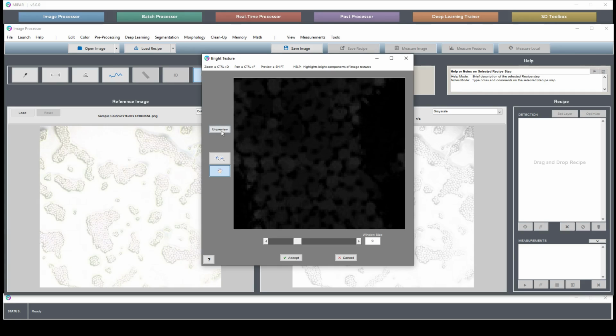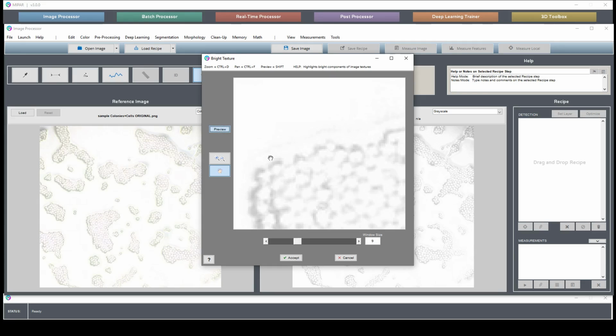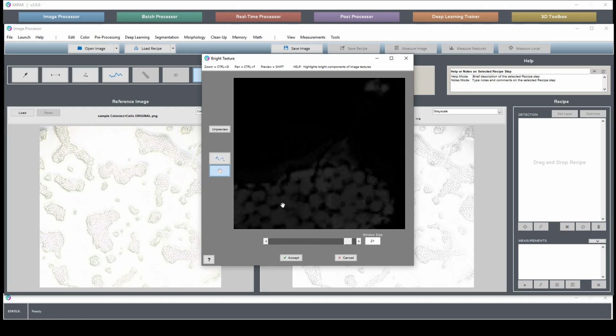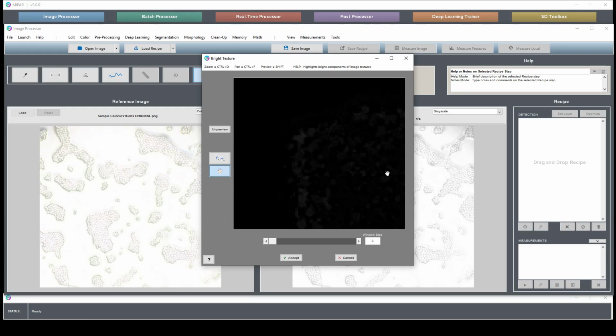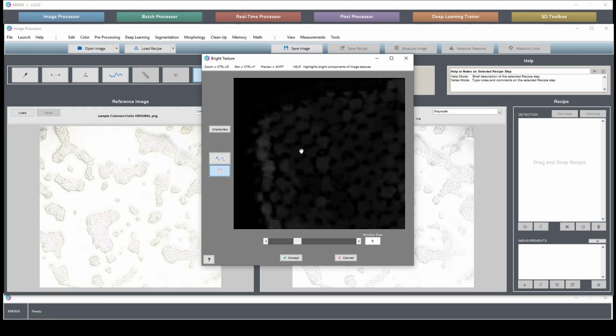And so when we get to 9, then we start seeing that we've picked up a lot of the cells. And really, we're comparing it to how much of the back of this space between the halo and the cells that we pick up. So above 9, we start to get some extra stuff over here, and we start to really lose a lot of improvement on the cells themselves. So really, 9 is pretty good for our purposes.